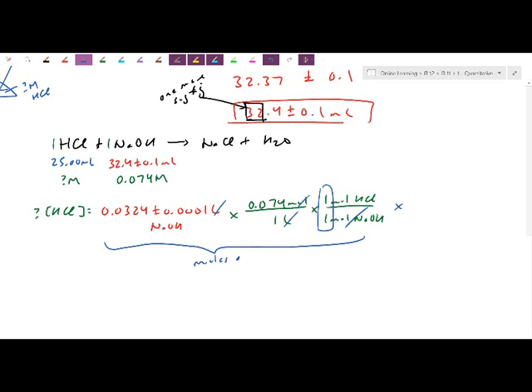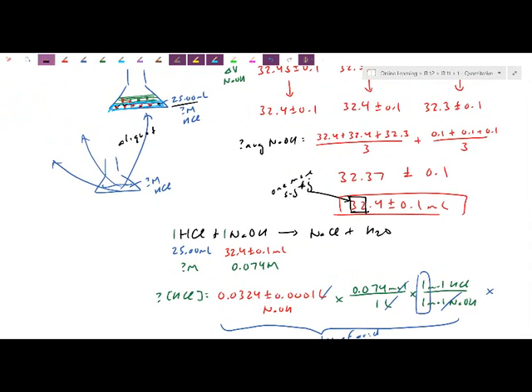This counted for you the moles of acid in the Erlenmeyer. And then again, what we wanted is the starting concentration. I don't want the acid after you mixed in the base, after you've sort of destroyed the sample and diluted it. I don't need that concentration. I just have this many moles of acid, this many swimmers, that used to just be in 25.